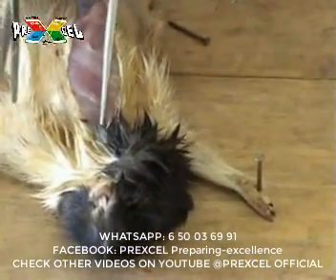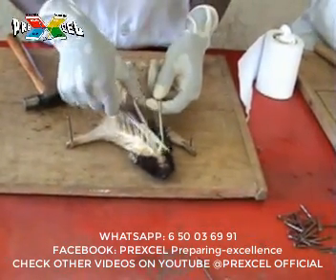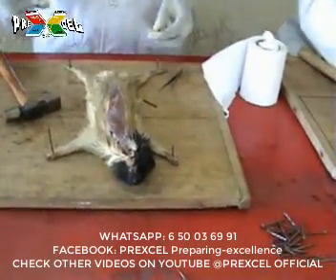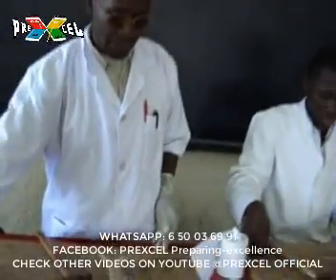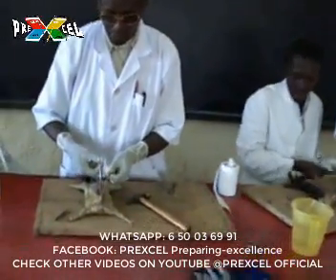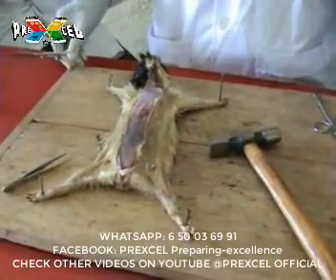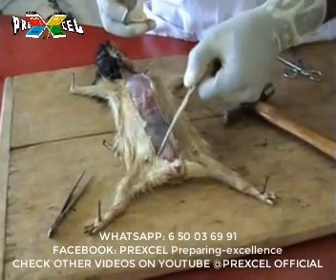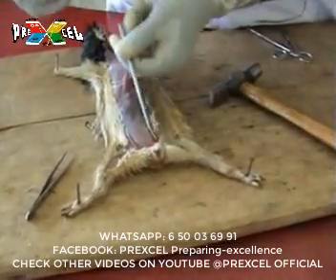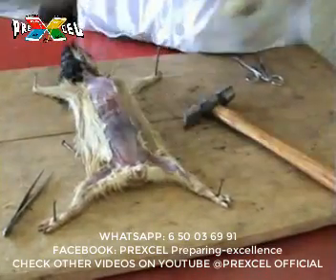You cut right up to the neck region of the guinea pig, and it is advisable to cut up to the lower part of the mouth. Then we turn our angle — we turn it and cut down again towards the angle. When we reach there, we stop, turn it slightly again, and cut towards the limbs. We cut this side also towards the limbs, using our probe.